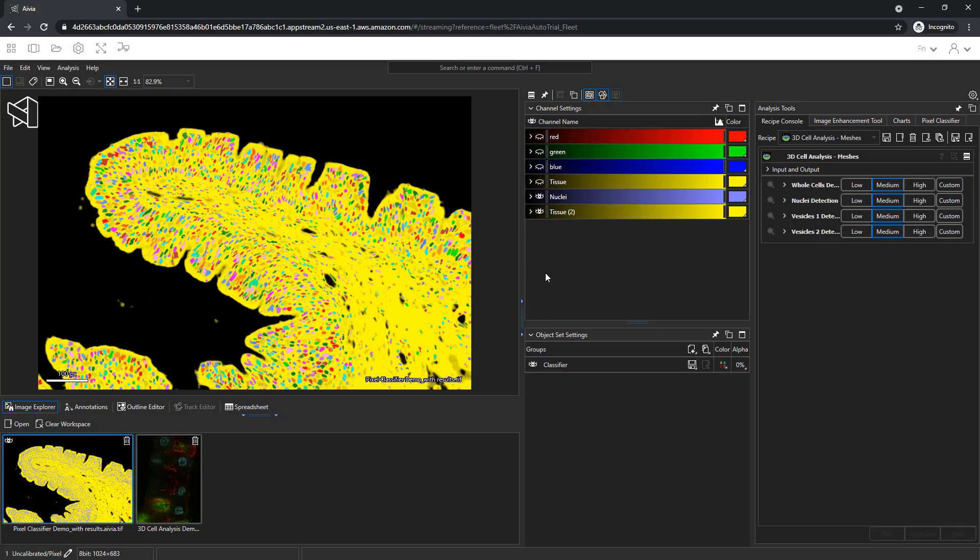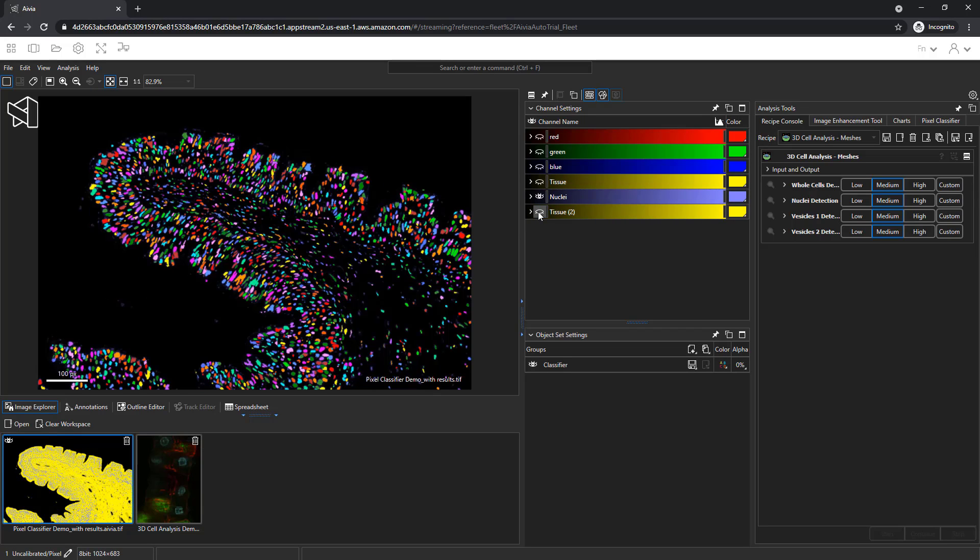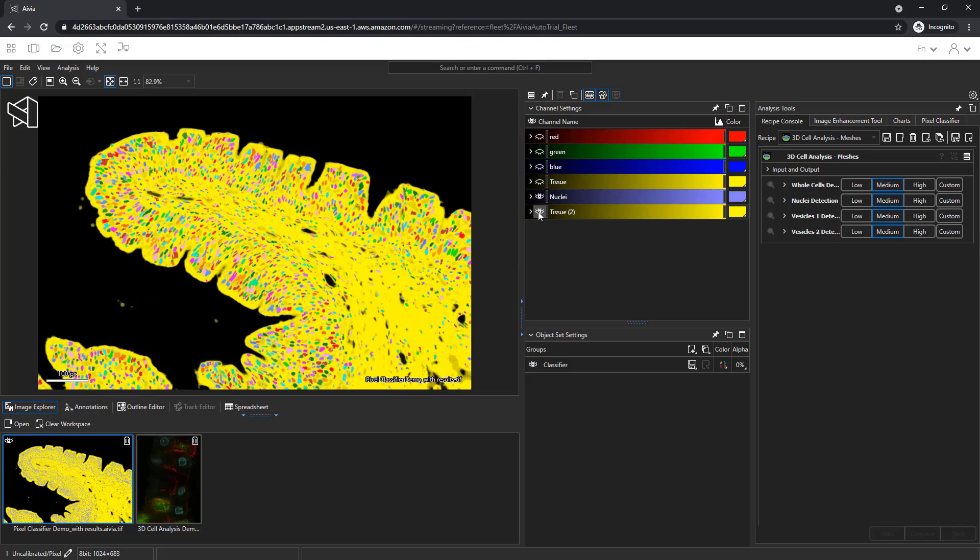As a reminder, you can click on this icon to turn on and off the display of a specific channel. And the same goes for toggling the display of the objects.